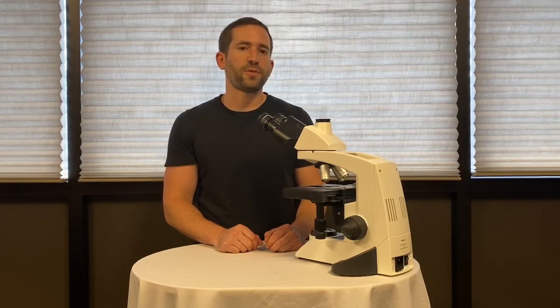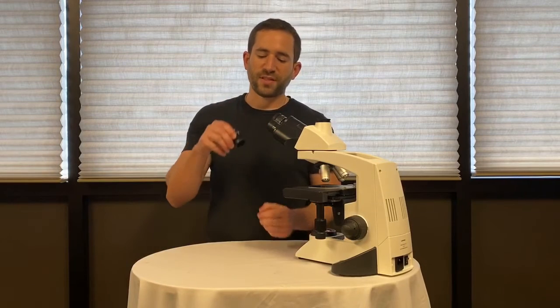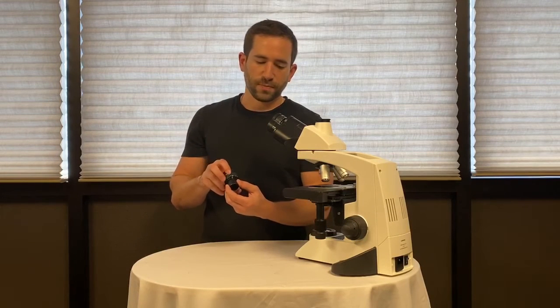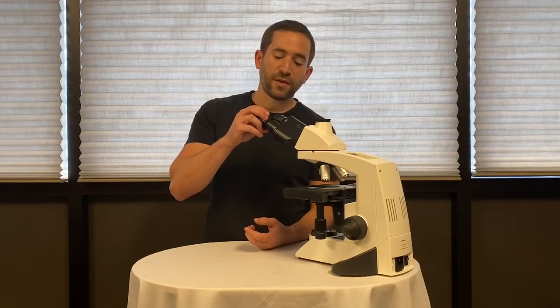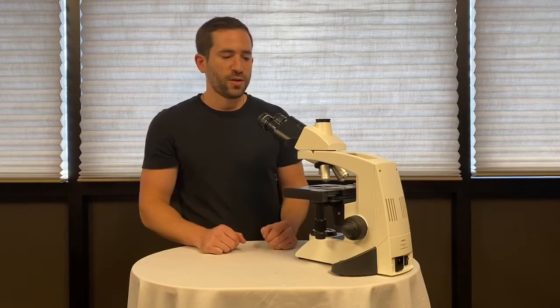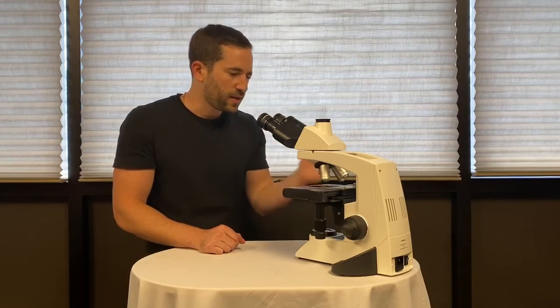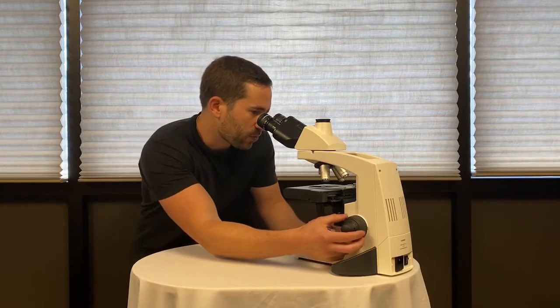This quick video is showing you how to focus and use your compound microscope. Make sure that your eyepieces are set to the zero mark — if you have two, this is very important. When the eyepieces are set to your zero mark, you're going to close one eye. I'll close my left eye and focus with the coarse adjustment.